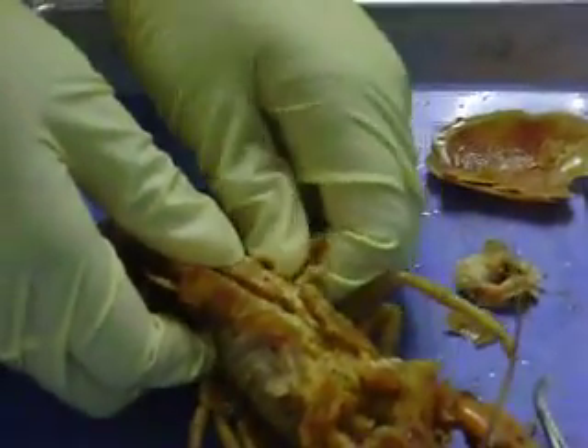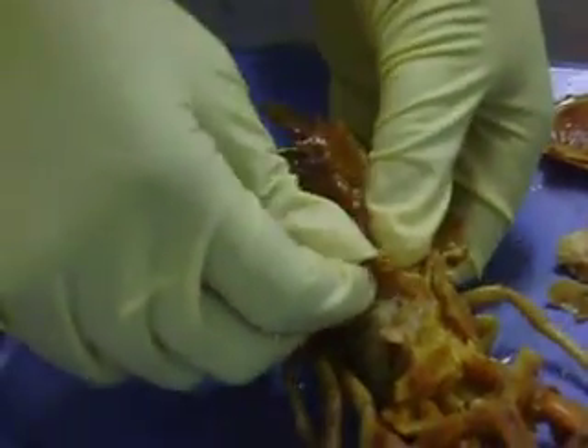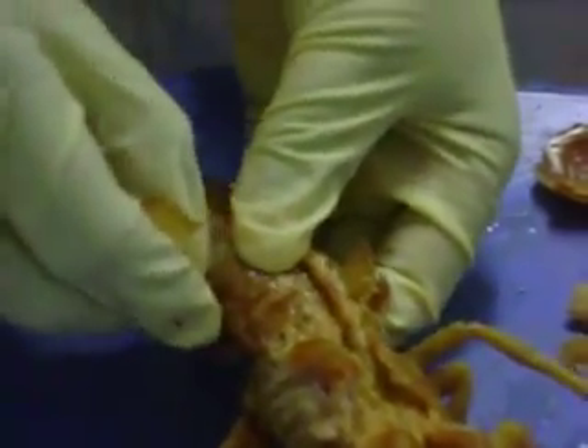The shell's not coming off very easily — it's trying to take the meat with it. So this right here is what we eat. That right there — that's the meat.